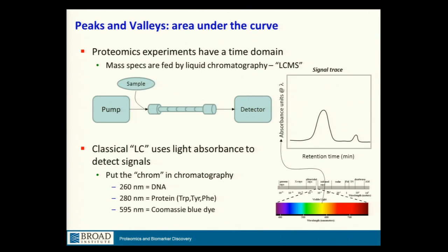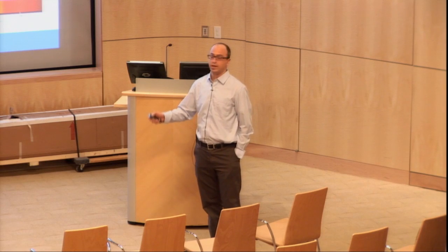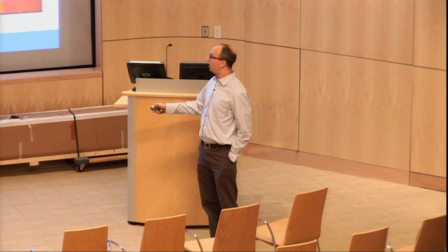Okay, so it's important to remember that in our modern era most mass spectrometers are fed by chromatographs. Chromatography, I'm sure most of you know, you have a column that has some kind of packing material, stationary phase inside, that has some kind of functionalized chemistry in there. You put stuff onto this column, and the properties of the interactions between that stationary phase and all the molecules in the sample should allow things to separate in time as you pump solvents across this column.